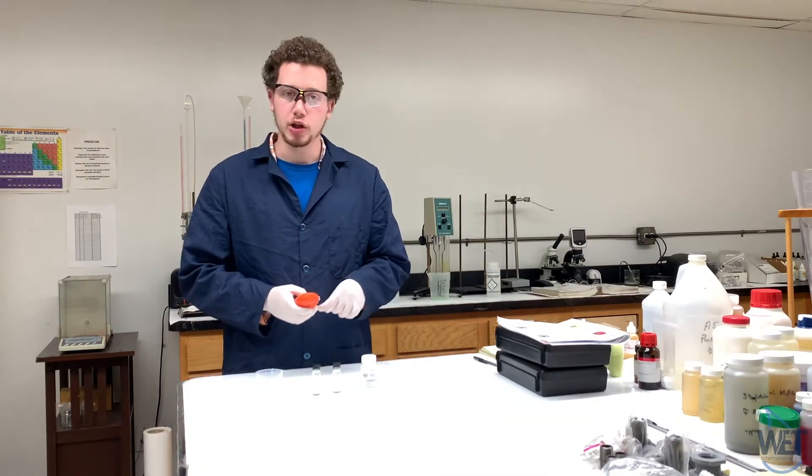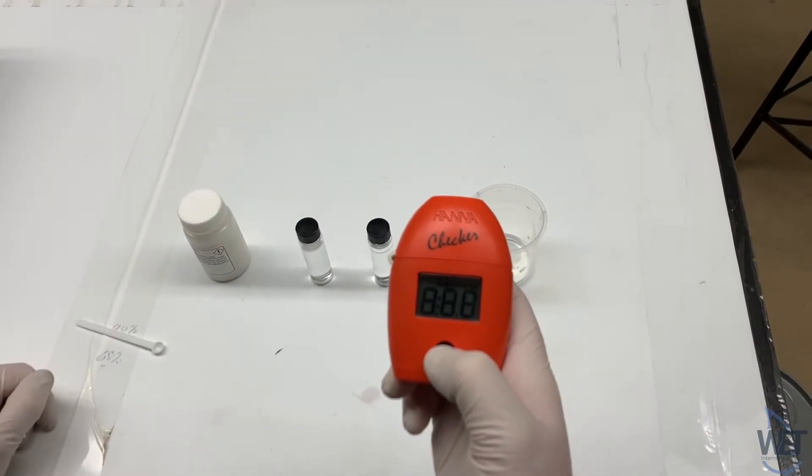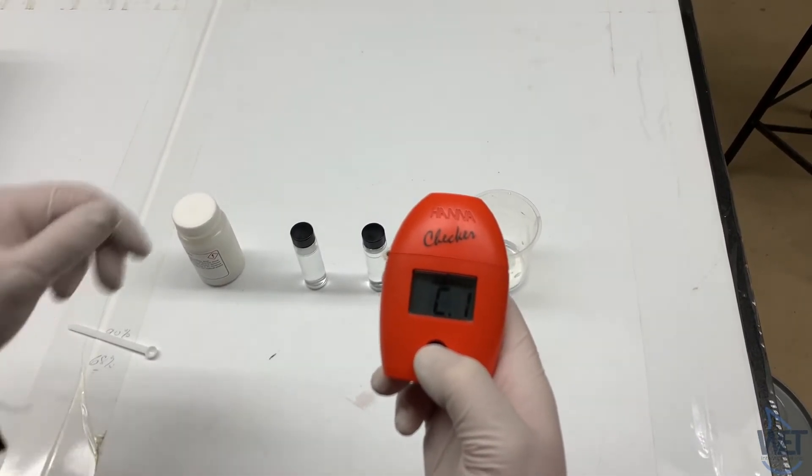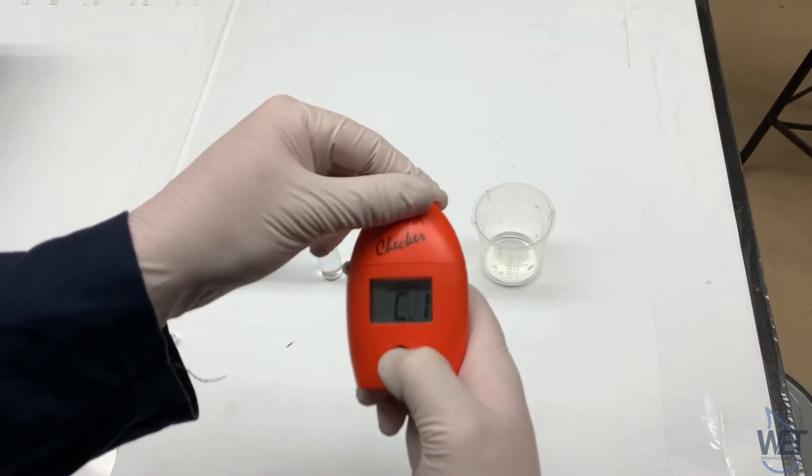After the three minutes are up, you can turn on your colorimeter by pressing the black button. When C1 comes up on the screen, you can insert your blank and press the black button.